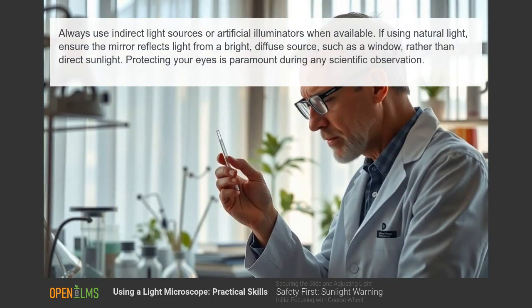Always use indirect light sources or artificial illuminators when available. If using natural light, ensure the mirror reflects light from a bright, diffuse source, such as a window, rather than direct sunlight. Protecting your eyes is paramount during any scientific observation.